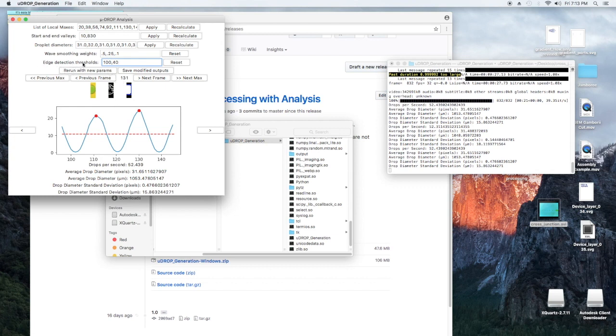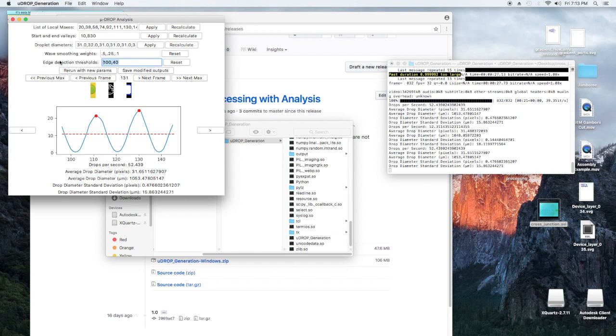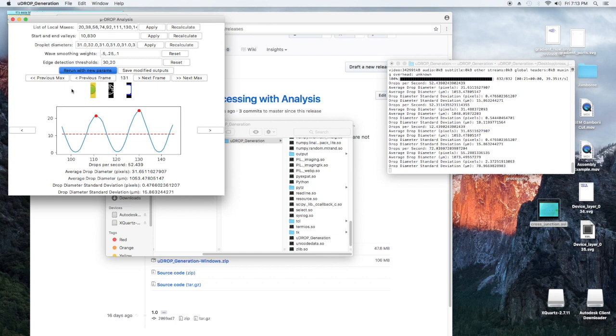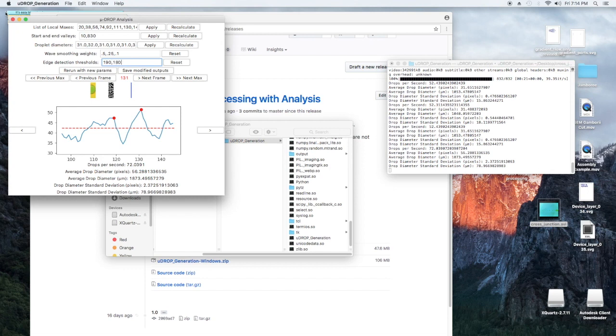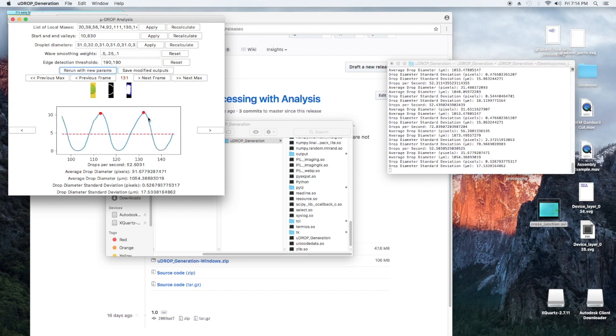The next thing you can do is if your contours are looking weird, you can fix it with the edge detection thresholds, which is a little more complicated. So you're only messing with this if you know what you're doing. But if you are confident that there's a problem with either too much noise or too little noise, I'll show you what too much noise looks like. So let's decrease our threshold values. So let's do 30, 20. Rerun with these params. This is a low edge detection threshold. So it's going to detect a lot of edges like this. And you're going to get a really screwed up graph that looks something like this. And then I'll show you what it looks like when you have way too high edge detection thresholds. We'll do 190, 180.